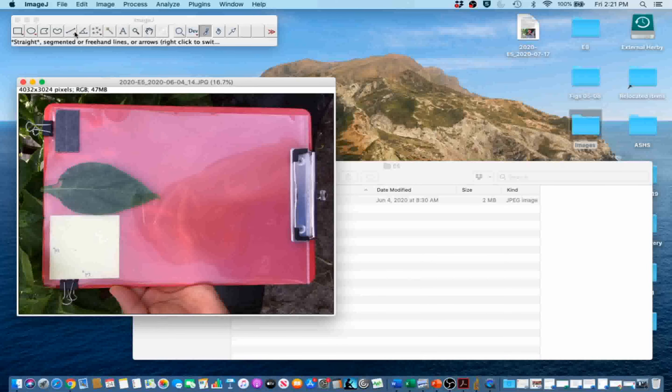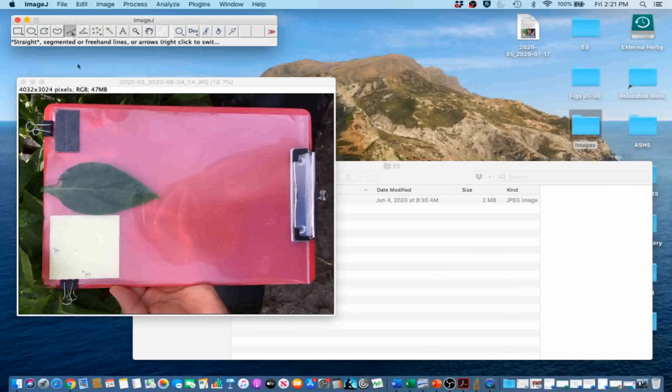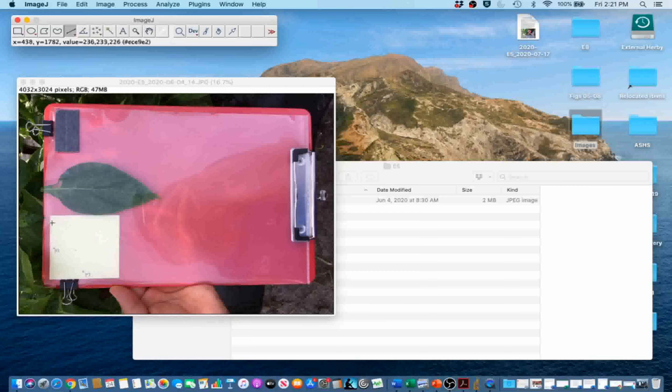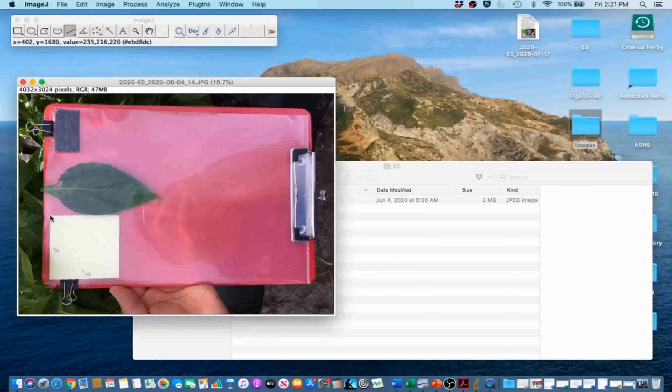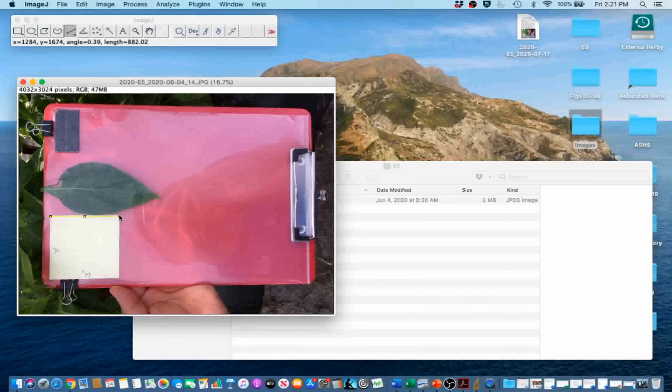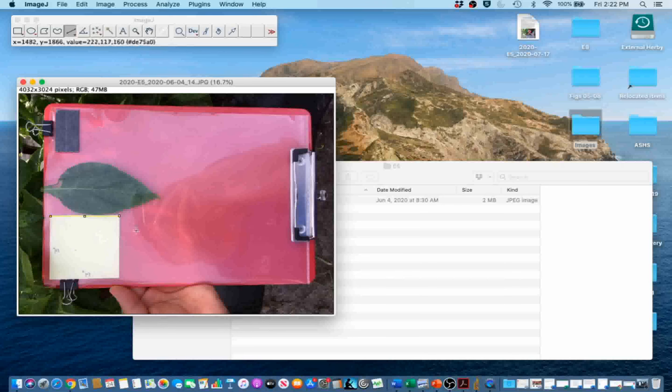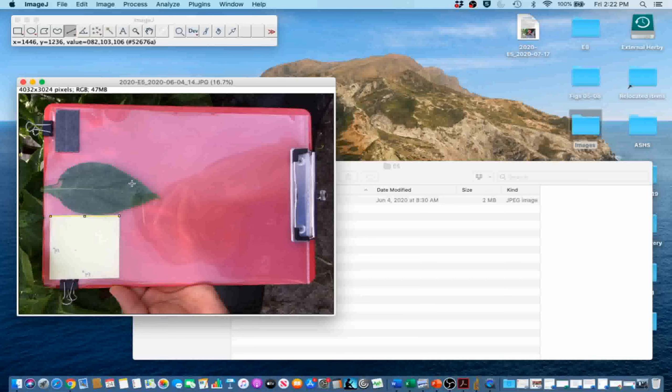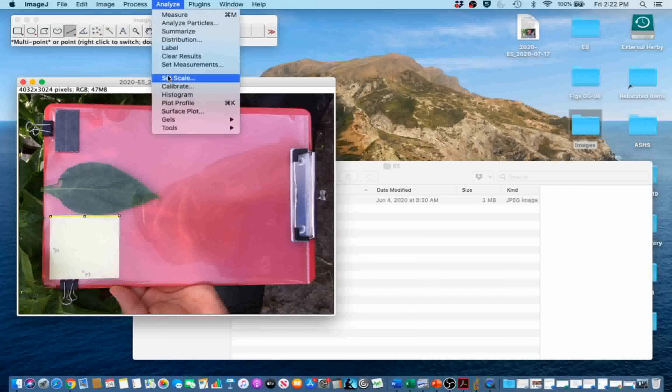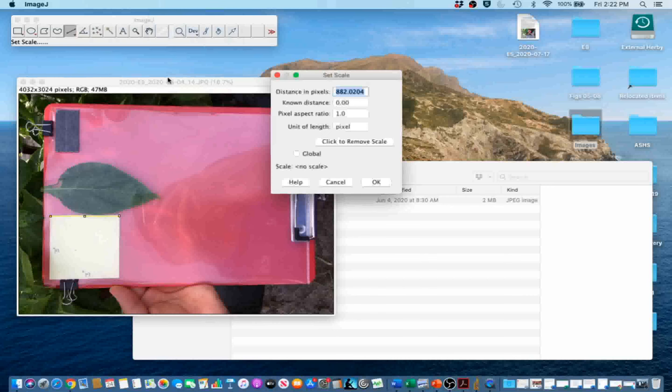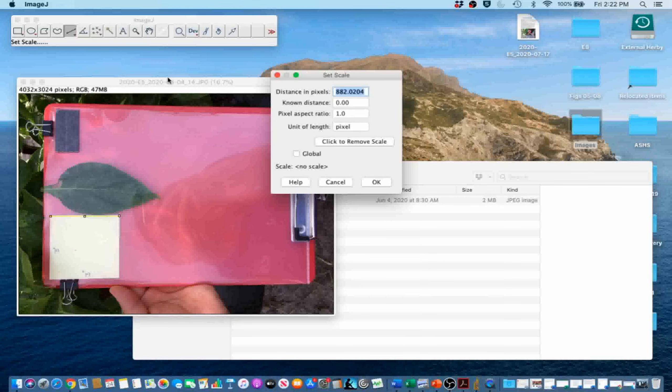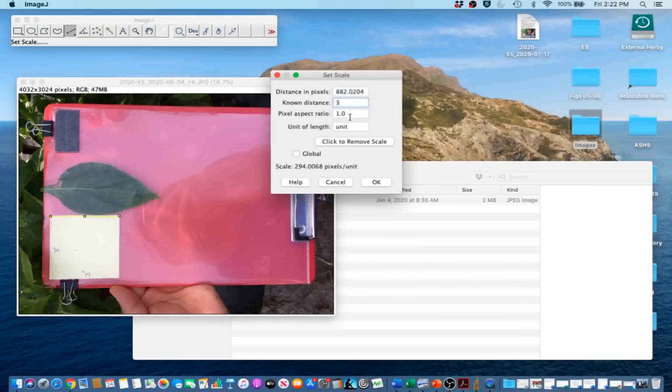Go ahead and select the Straight Line tool. Draw a line to an object of known size, in this case the post-it right here. You can also use the clipboard to scale this kind of image. Now we are going to set the distance to the line. Go to Analyze, Set Scale. We know the post-it is a 3 inch post-it, so we are going to set the known distance to 3, and the unit of length to inch.